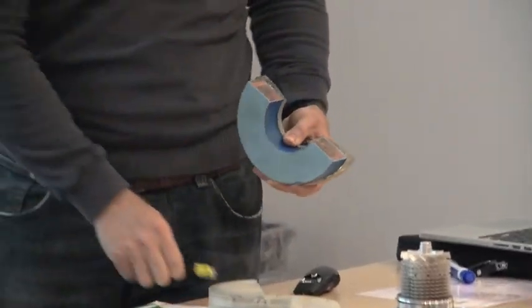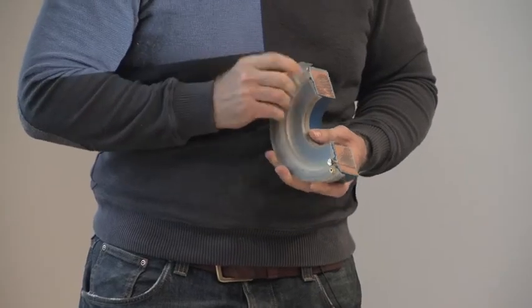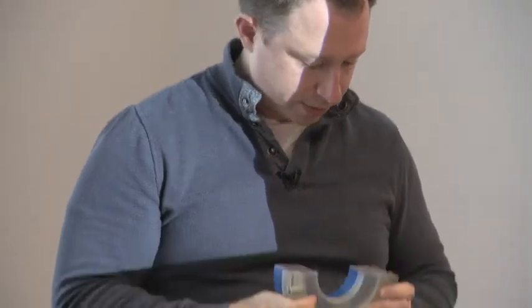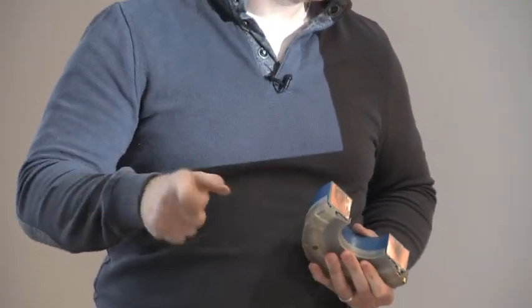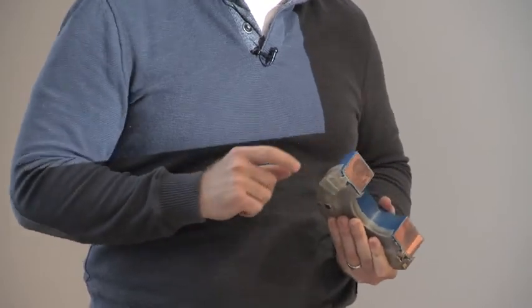And I actually have an objective lens from an electron microscope here. This is an old one from one of our old microscopes, after it died, so afterwards you can take a look. You can actually see the copper coils. You can see the dimensions. This is how big a real electron microscope lens is. This happens to be from the F30. Obviously it doesn't work anymore. But when you're turning that knob on the electron microscope, you're really changing the amount of current that goes through one of these coils. And that's what's moving those electrons around.